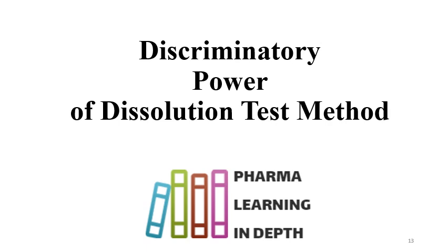So always follow all the guidelines which are related to the dissolution, and you should have the specification which is in line to the regulatory requirements. Do not give too much wide specification or relaxed specification to the formulation. Otherwise, it will be very difficult to justify the specification itself, and also it will be very difficult to justify the dissolution method discriminatory power for that dissolution.